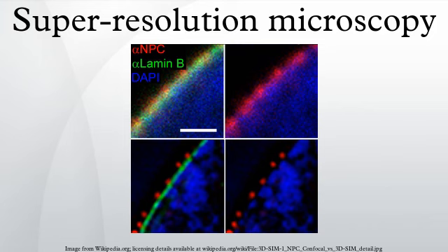Local enhancement/ANSOM, optical nanoantennas: instead of forcing photons down a tiny tip, some techniques create a local bright spot in an otherwise diffraction-limited spot. ANSOM is apertureless NSOM. It uses a tip very close to a fluorophore to enhance the local electric field the fluorophore sees.